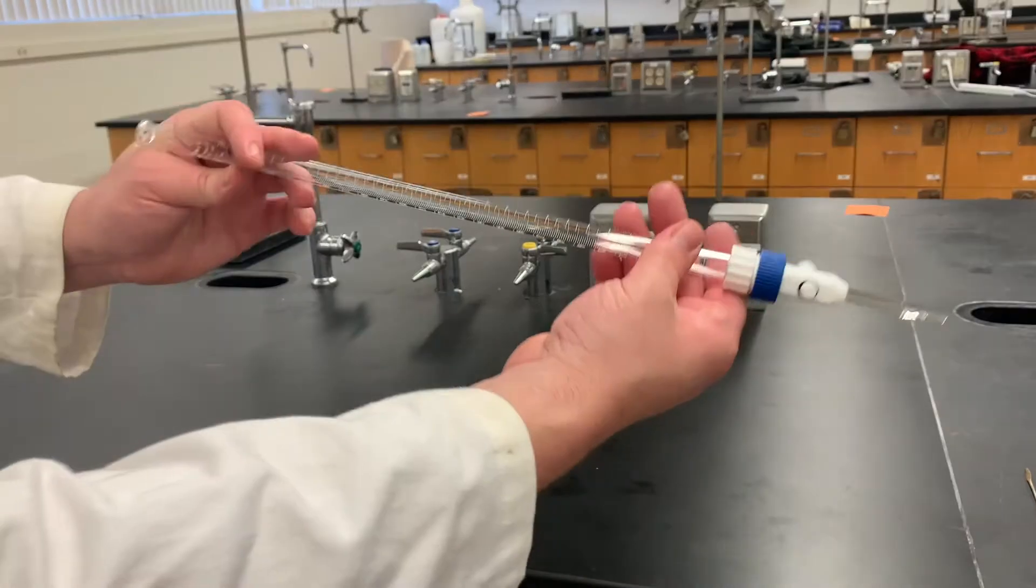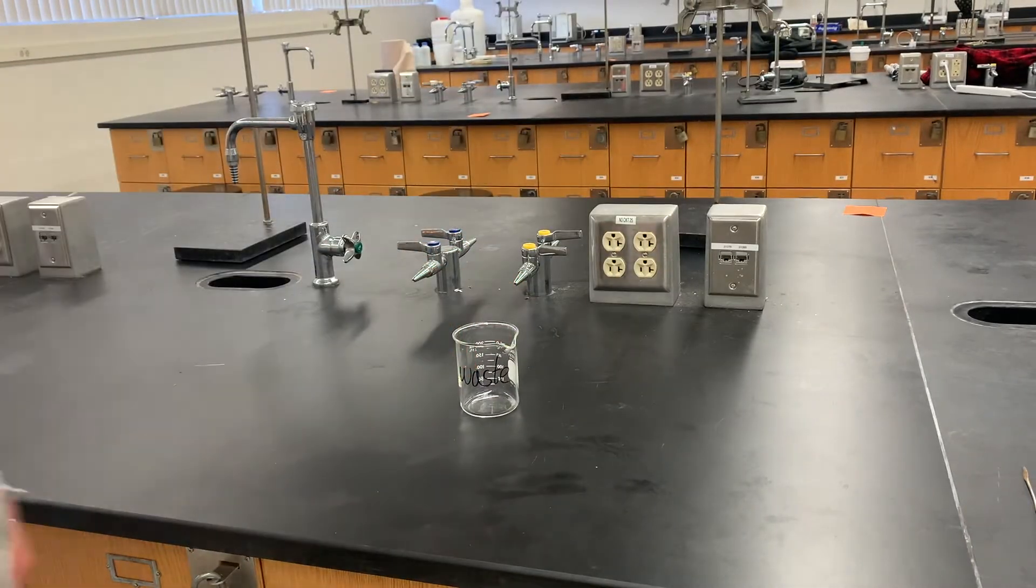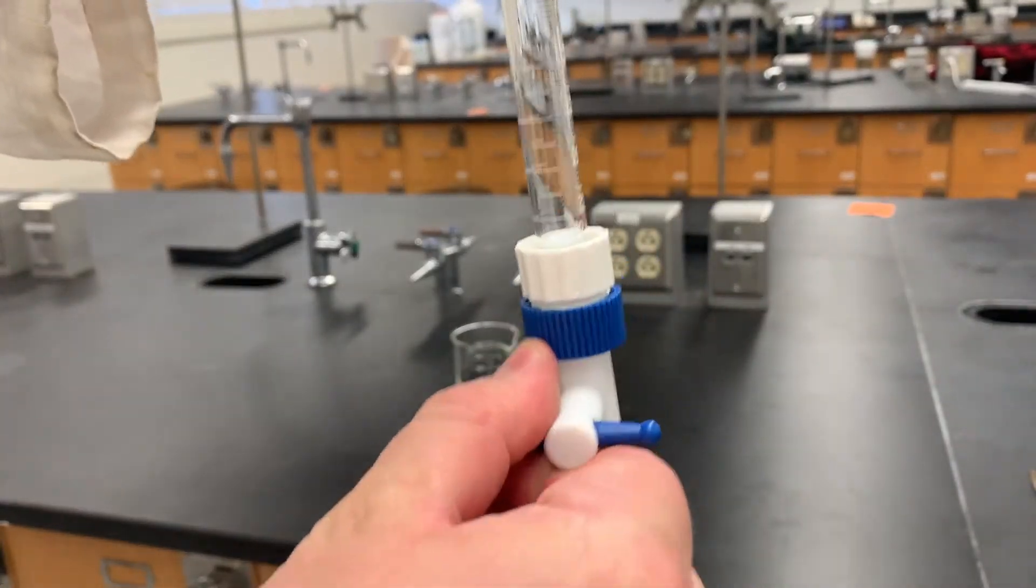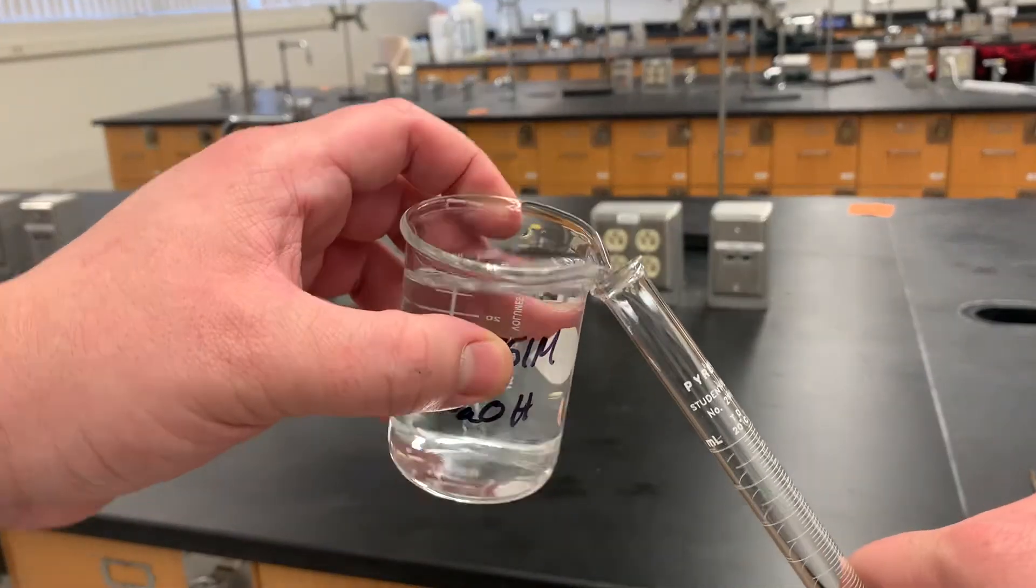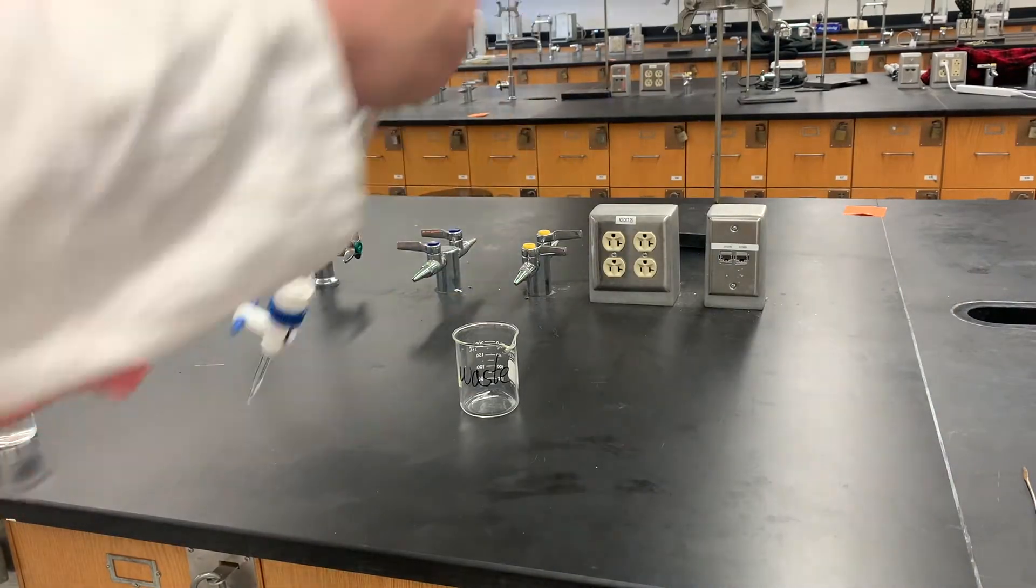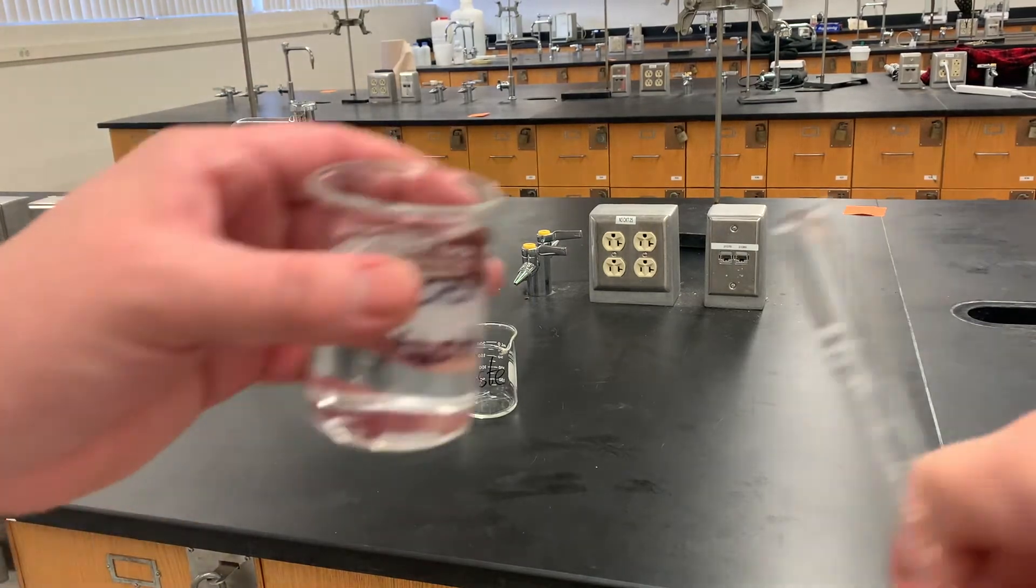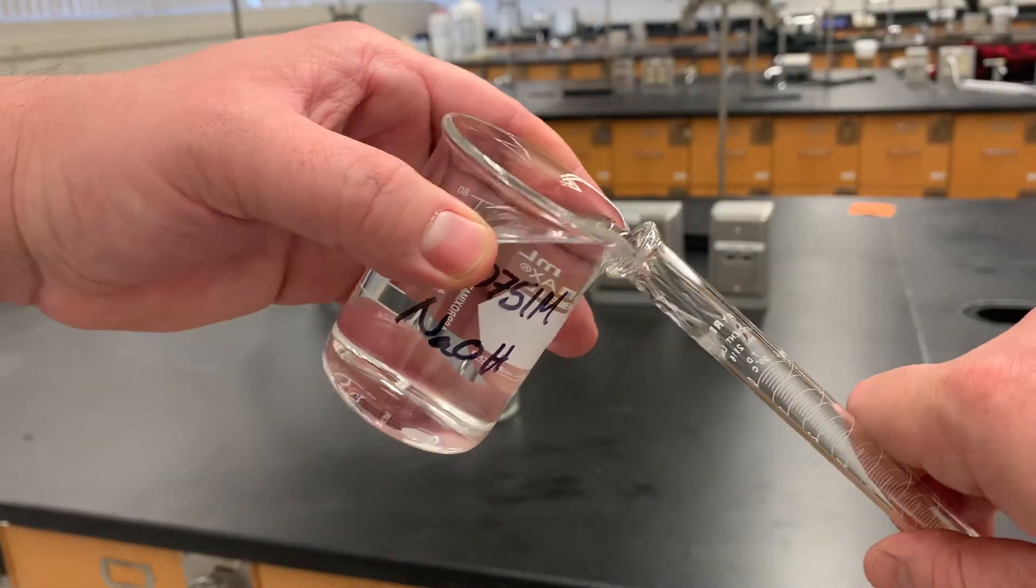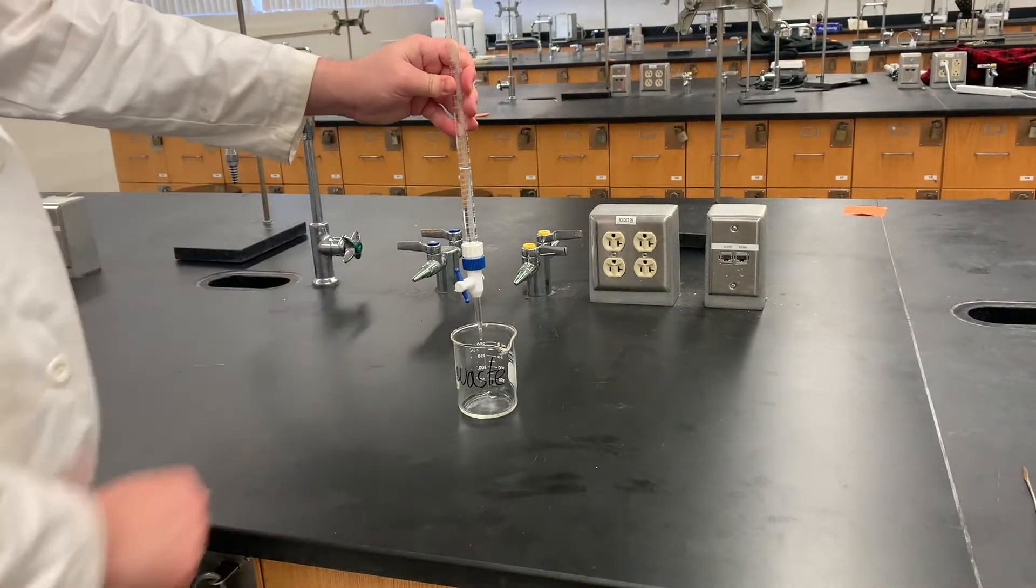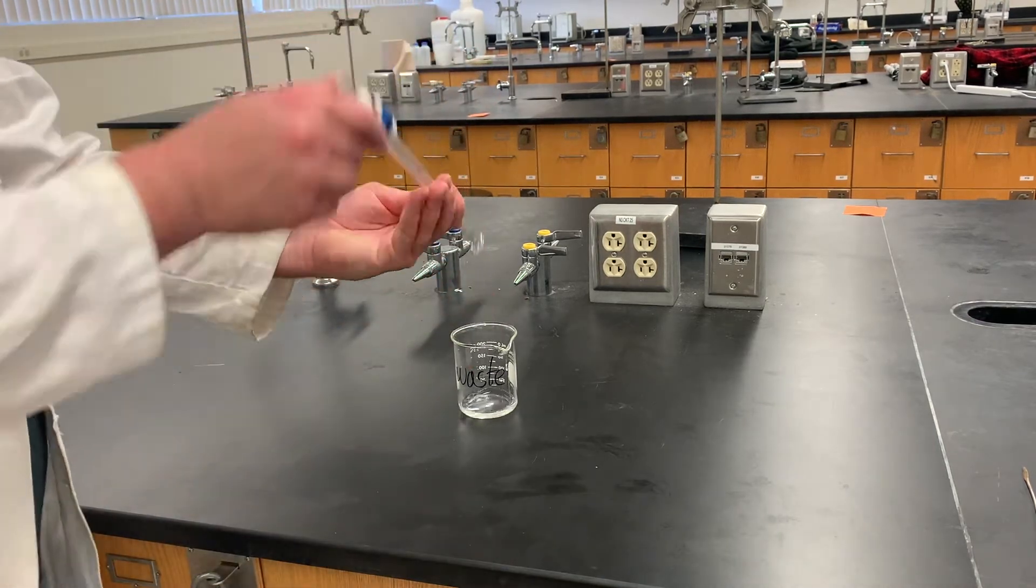Next, we're going to need a burette. We want to clean this out. So we will need a waste container right there. Take our burette here. Make sure that it's closed. Add some in. Swirl, swirl, swirl. Pour out. Repeat. Let some drain. And when you get sick of that, you can just force that out.